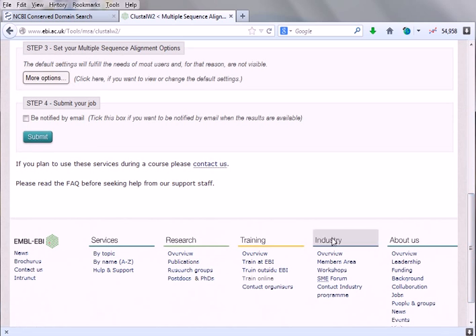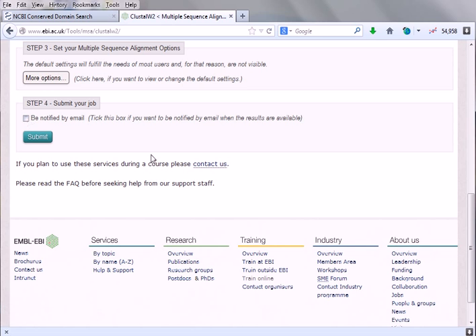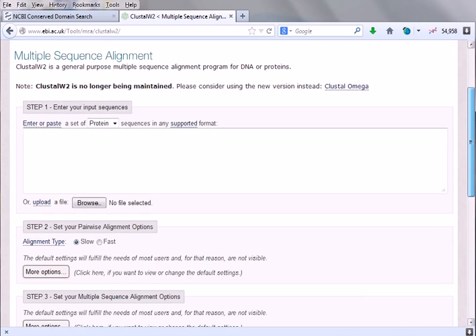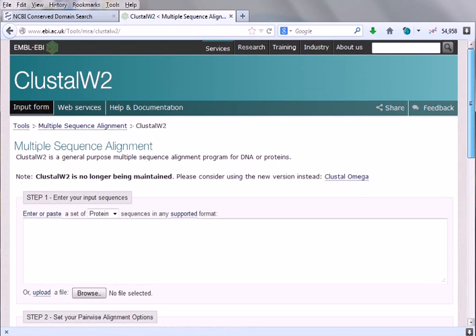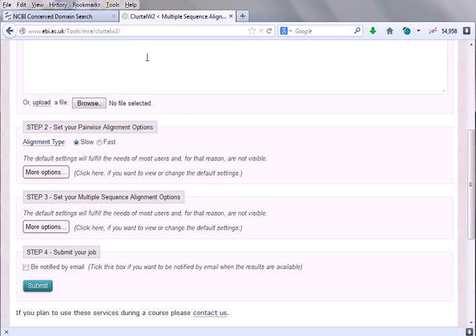Then we'll hit submit. Here is a box suggesting be notified by mail. If you click this box, after completion of our job it will send us a mail having the link of our result. This is good because if you upload the sequence and hit submit, then go out of this website and do other jobs, you can come back later.